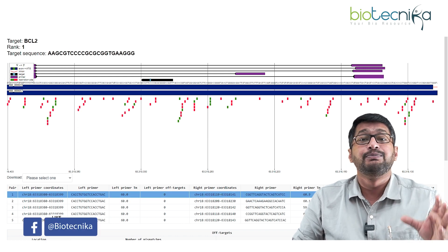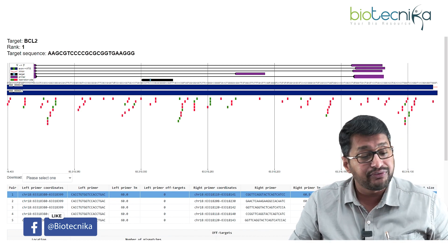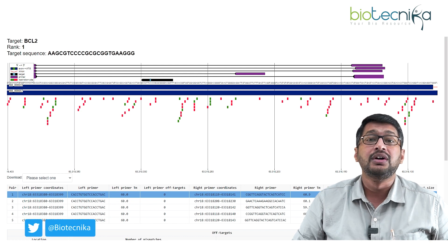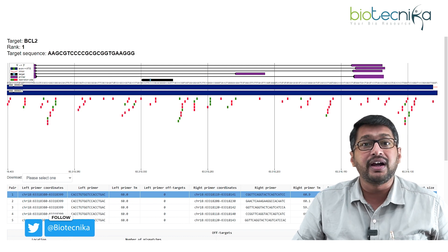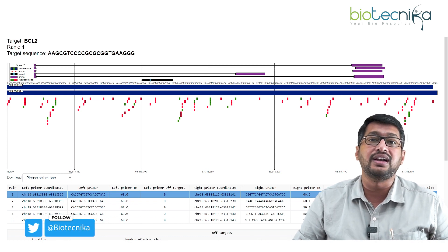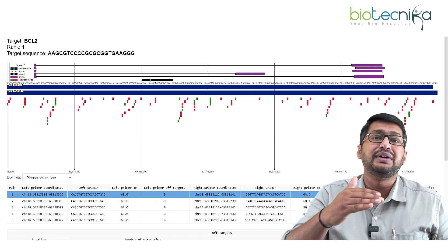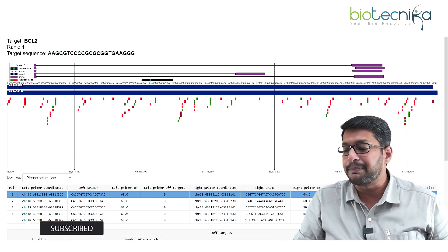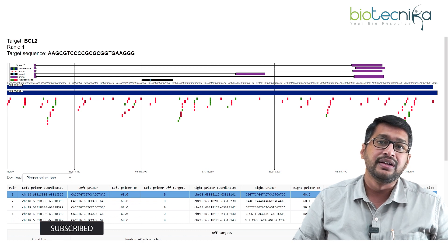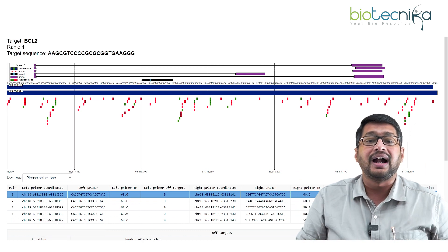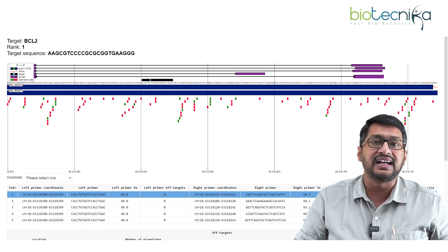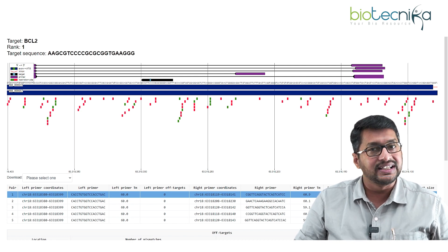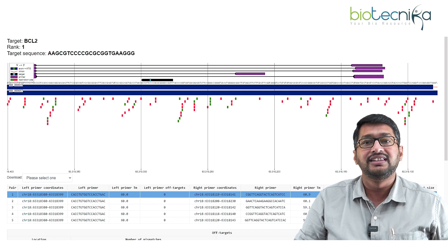The tool also tells us the approximate amplicon size: approximately 280 bp. When I run an electrophoretic gel after amplification, I should get a product of around 280 bp. This is within acceptable limits, and this is how you design a primer for your CRISPR target sequence.